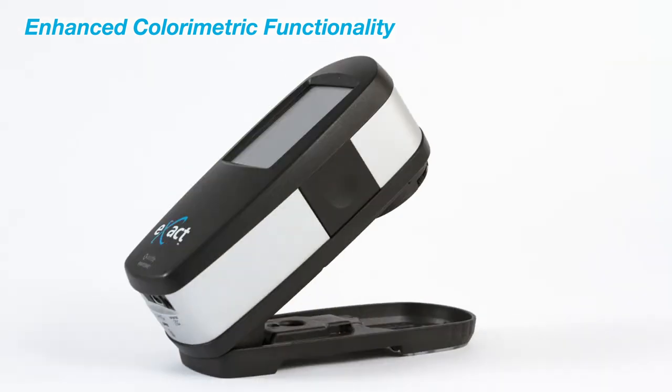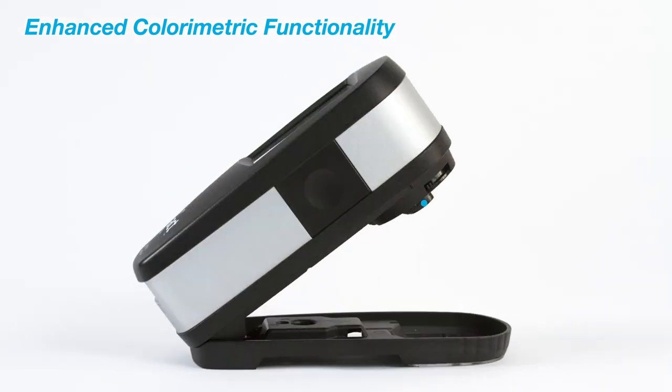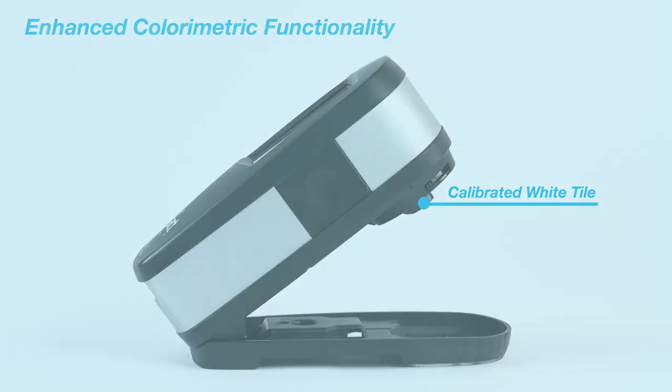A state-of-the-art calibrated white tile is integrated to guard against dust and fingerprints, and provides you with the most accurate calibration, ensuring you will have the most precise measurements each and every time.